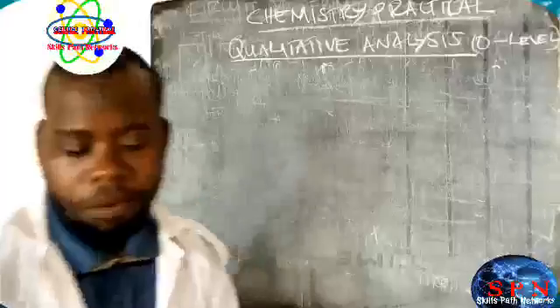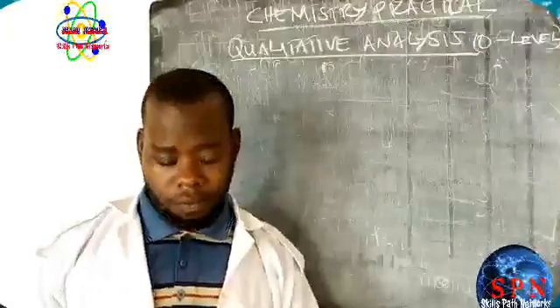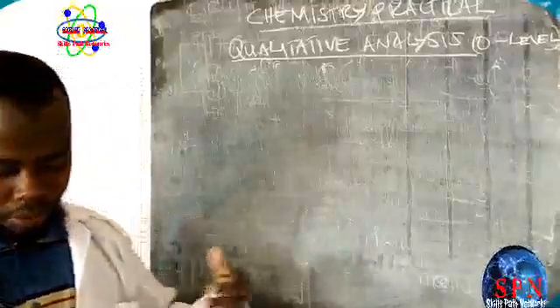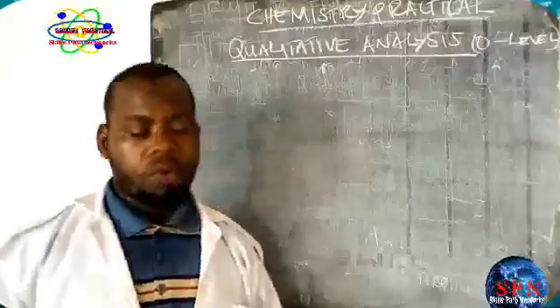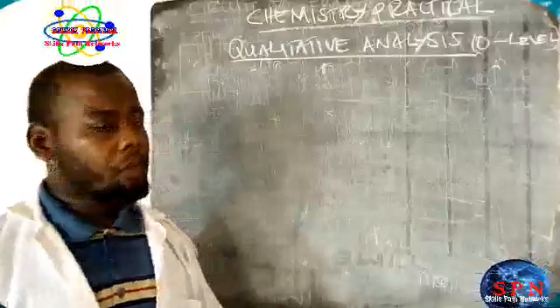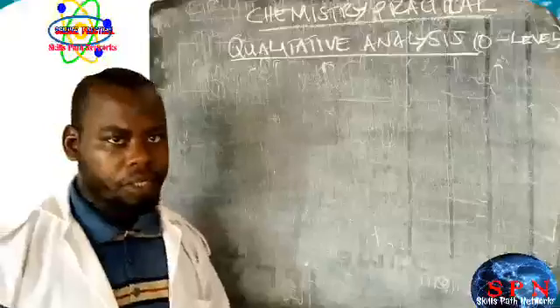There is a guide sheet prepared for this practical, and you use it for identifying the various samples of the compound.